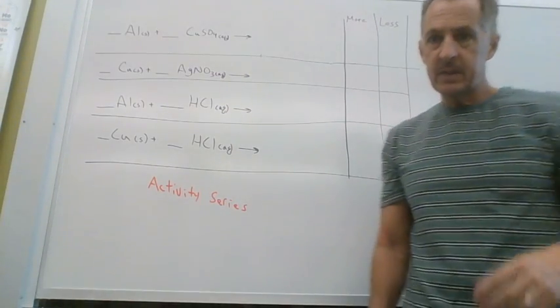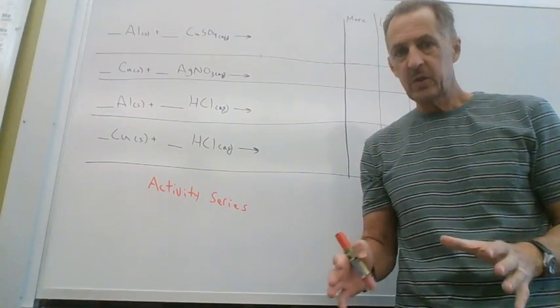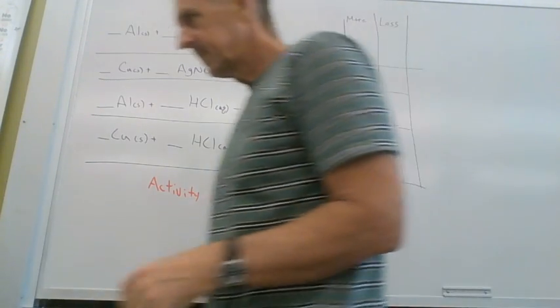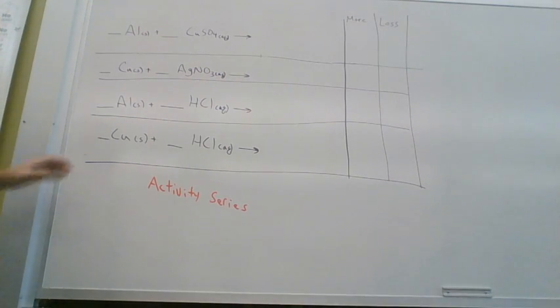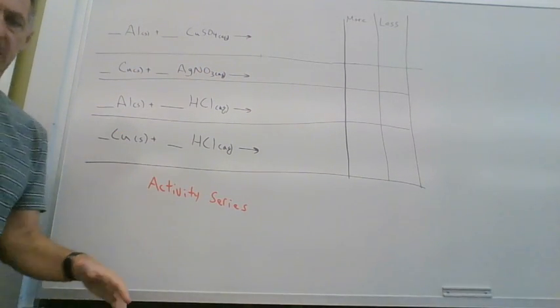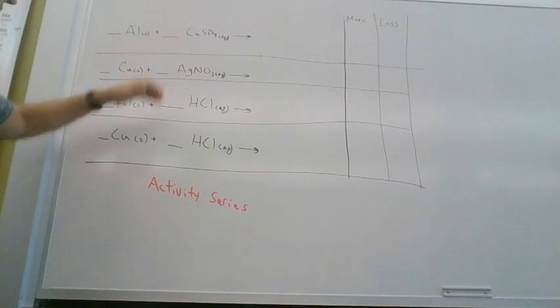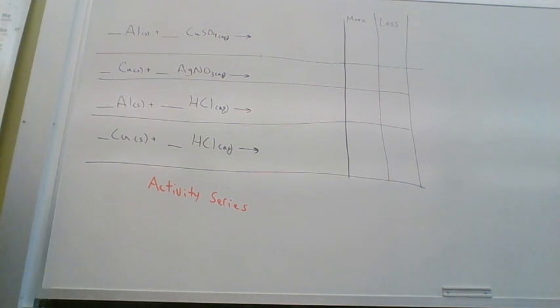Now that we've collected that data, I'm going to show you what we're going to do with it. If you flip to the next page in your lab, you should have a chart that looks like this, but with the equations we just did. I'll show you how to fill it in with this theoretical data here.